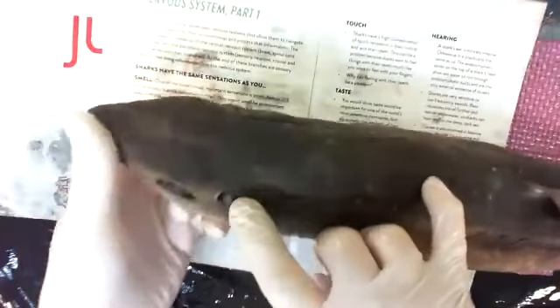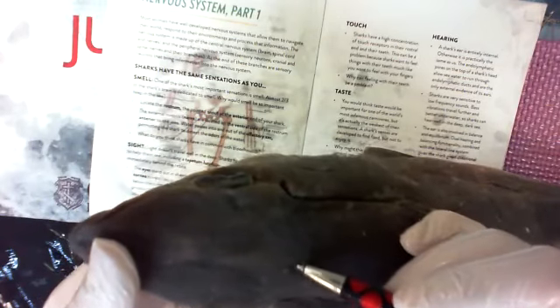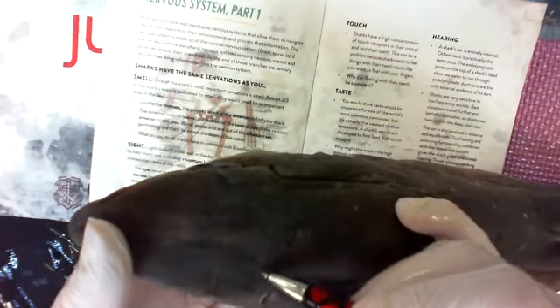Right, taste. Hearing, that is not an ear. The things that are closest to an ear, there they are right there. I don't know if you can see that little speck. It's a dot, and there's another one right there. 2 little holes. So these tubes let water flow down and circulate around the ear. A shark's ear is kind of like ours, but not at all.